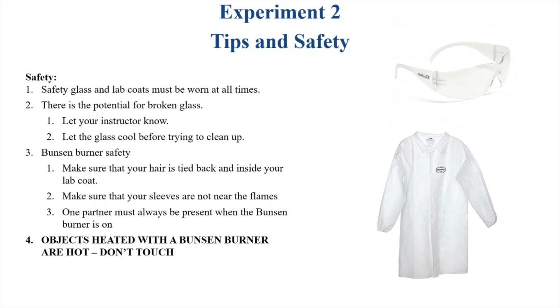And then the student looks at me, and I look at the student, and then they immediately try to clean it up, and they touch the hot pieces of ceramic again. So it's always important to be cognizant of the fact that when things are hot, they're going to be hot for quite a while. So don't touch them if they're hot.